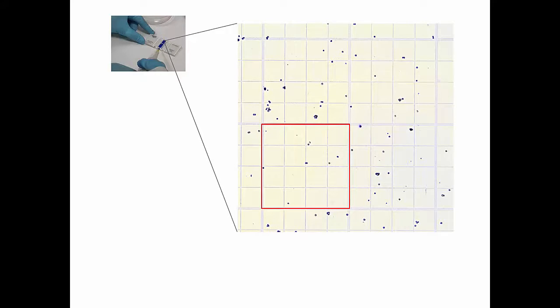Each square is subdivided into 16 smaller squares. Count all the cells in one 16 square region, as shown in the figure. To avoid counting cells twice at the edges of the area, count only those cells on the lines of two sides of a square. In this example the cells touching the upper and left limits should be counted, here marked by thicker lines.